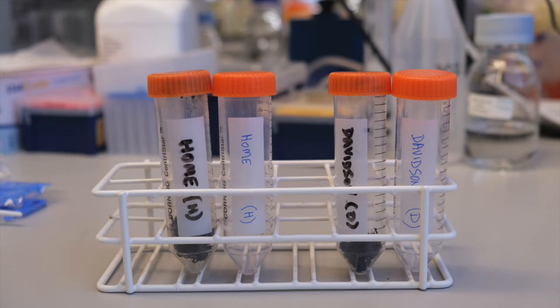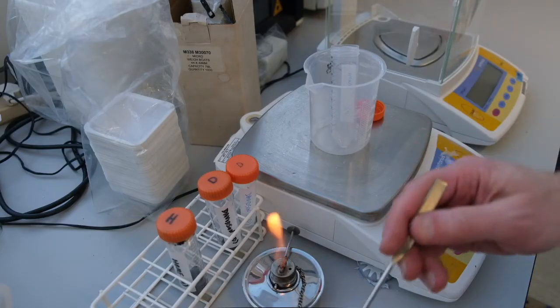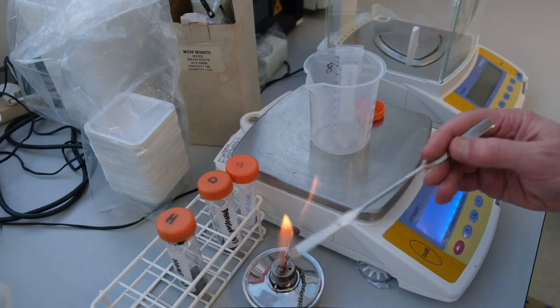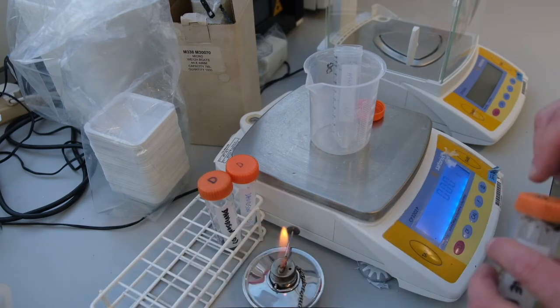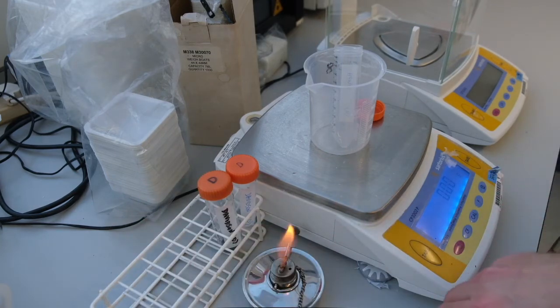We will now transfer a small sample into fresh sterile tubes. Using a sterile spatula, we can transfer into pre-weigh tubes and this way record the exact weight of each soil sample used.